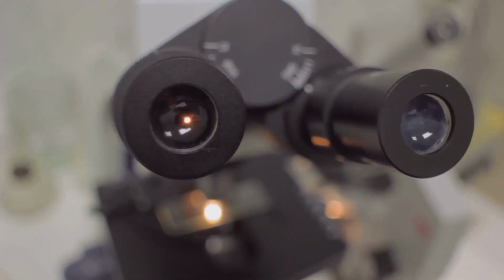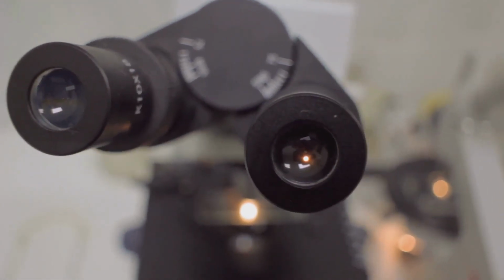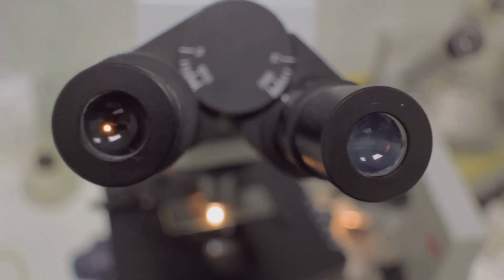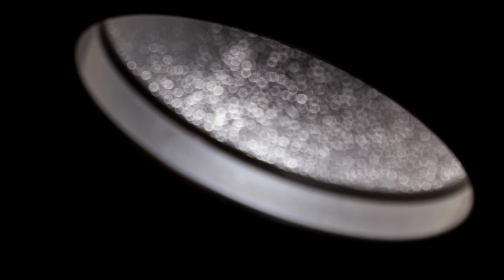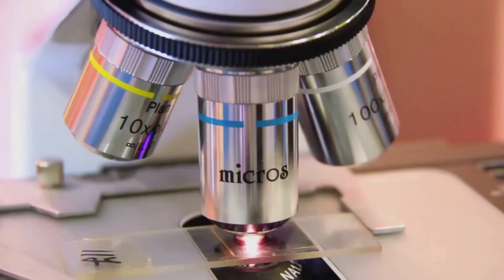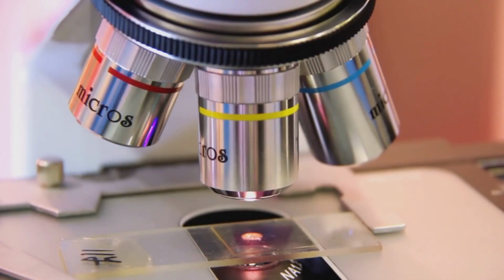You look through a lens at the top called the eyepiece. The final image you see is magnified twice. First by the objective lens, which is the one right above the sample, and then again by the eyepiece lens. If the objective lens magnifies the image 40 times and the eyepiece magnifies it 10 times, your total magnification is 40 times 10, which is 400 times. Most standard light microscopes can magnify things up to about 1,000 or maybe 1,500 times.